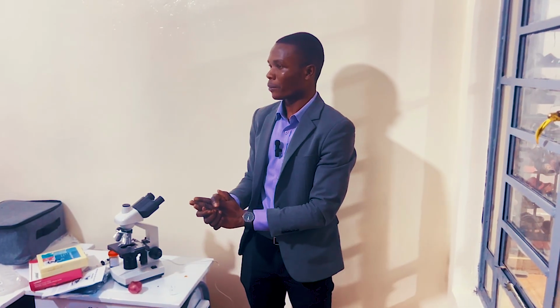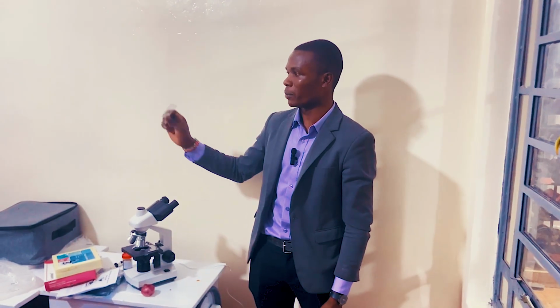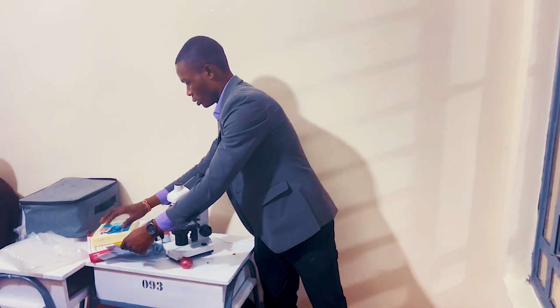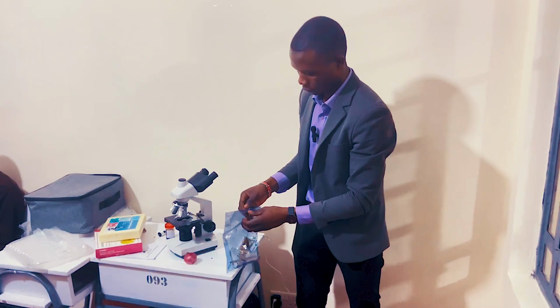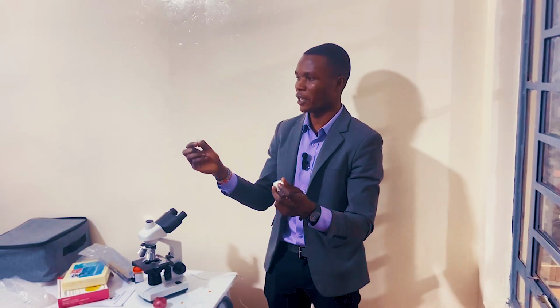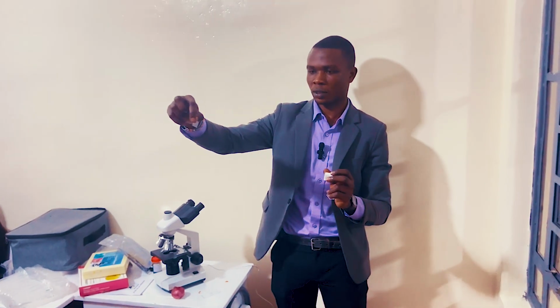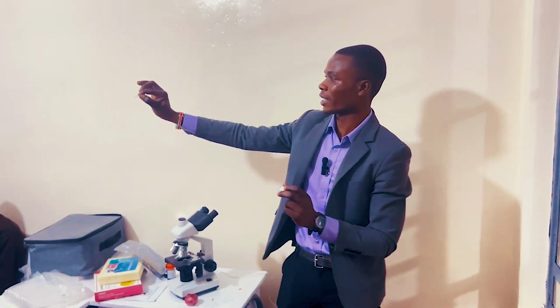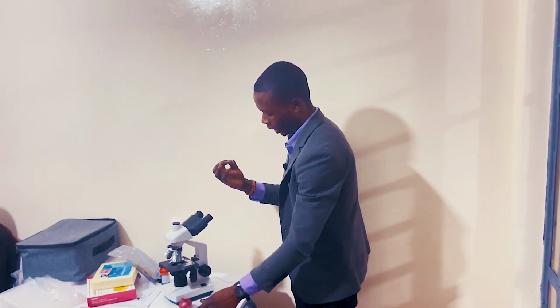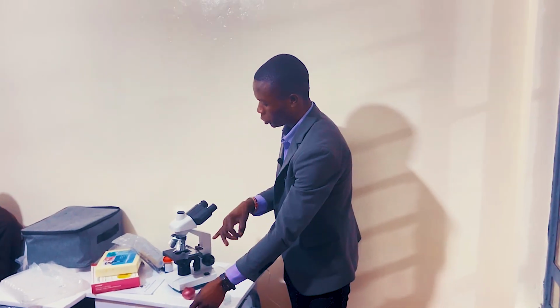After you've done that, we said the third step is to use cover slips. So how do you use cover slips? Cover slips are these ones. There are very many here, right? So these are the cover slips. After you have stained, you use the cover slip. All these you do before you introduce it to your microscope.